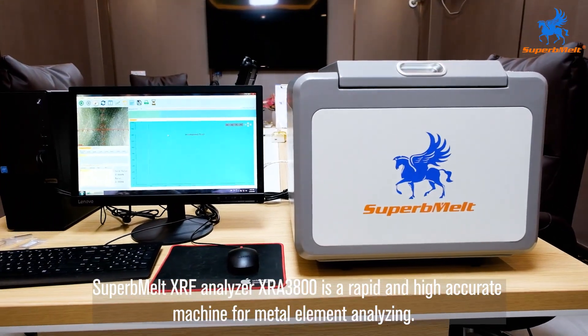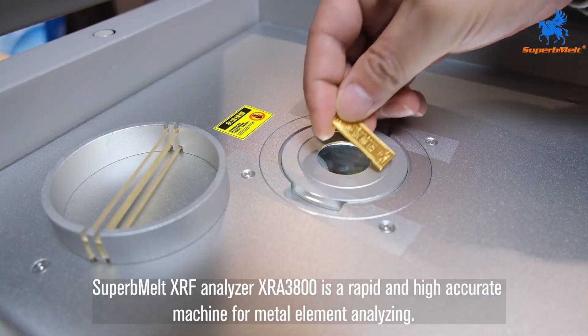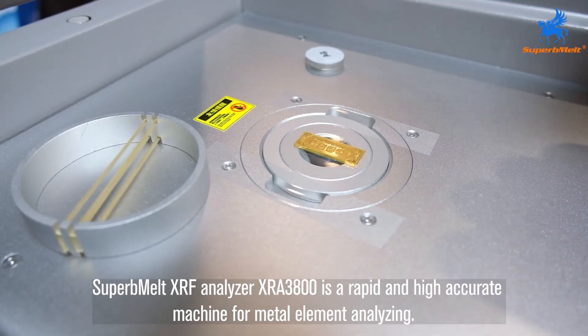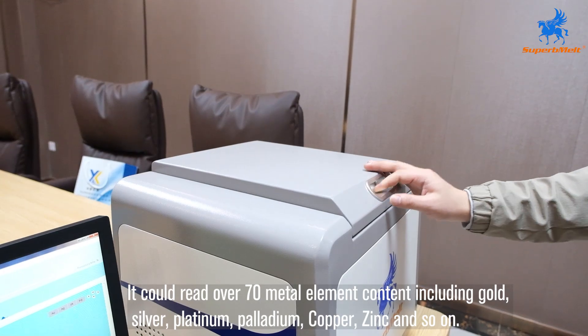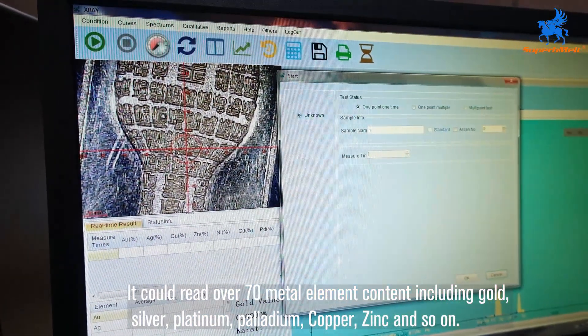Superb Melt XRF Analyzer XRA3800 is a rapid and high-accurate machine for metal element analyzing. It could read over 70 metal element content including gold, silver, platinum, palladium.